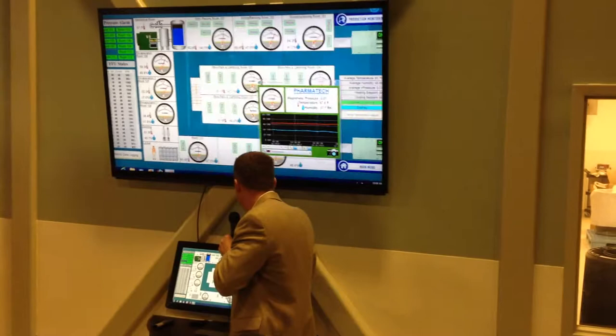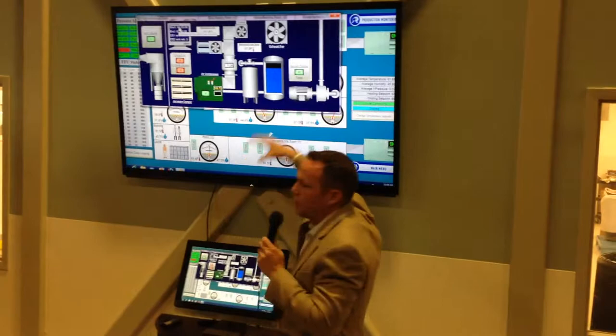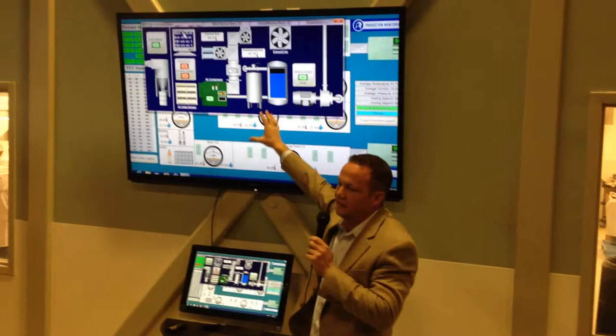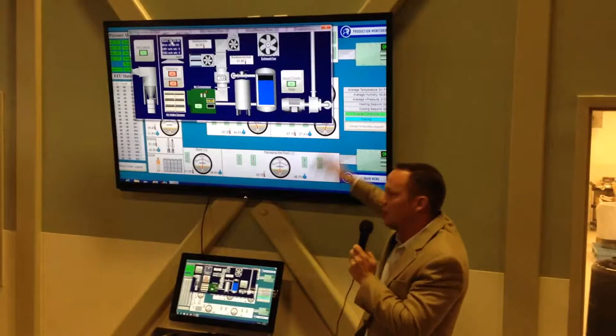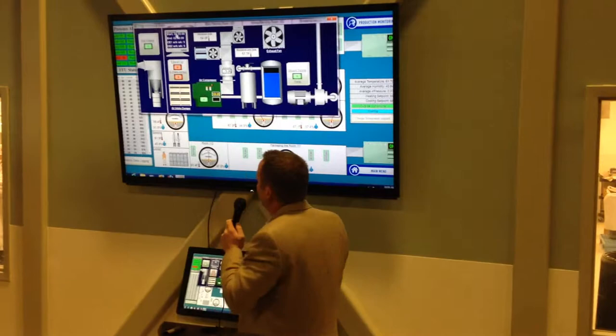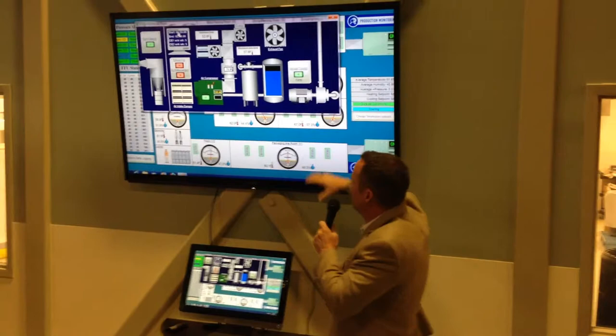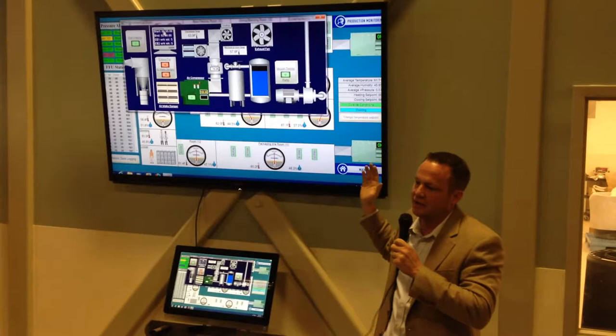That covers the machines and the climate control piece. This is our support equipment — everything in this room is run automatically by the computer system. Jason has an app that he can actually turn stuff on and off through his phone if he's not here. Before our first shift in the morning, it ramps up at around 5:30 AM, and after our last shift at 2:00 or 2:30 AM, it ramps down. We always keep the positive pressure going, but we don't keep it ramped up all the way until we're actually in production.